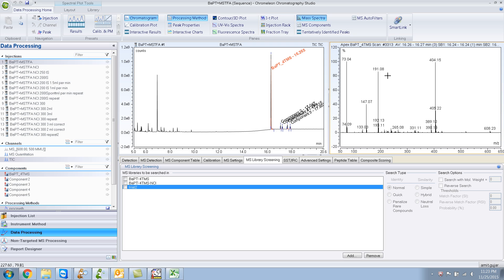There are two ways that you can do this. One of the ways is using Chromelion only. And the other way is using Chromelion and the NIST MSSearch program. And I'll show you both ways.